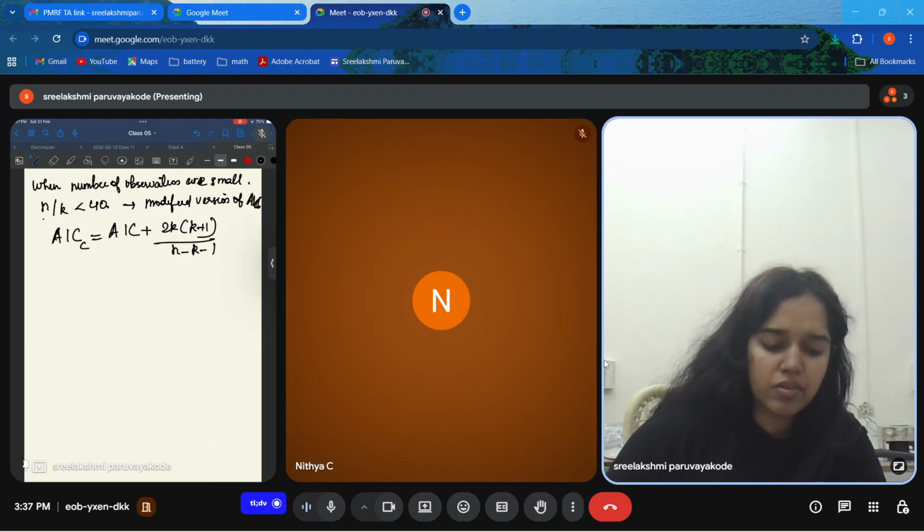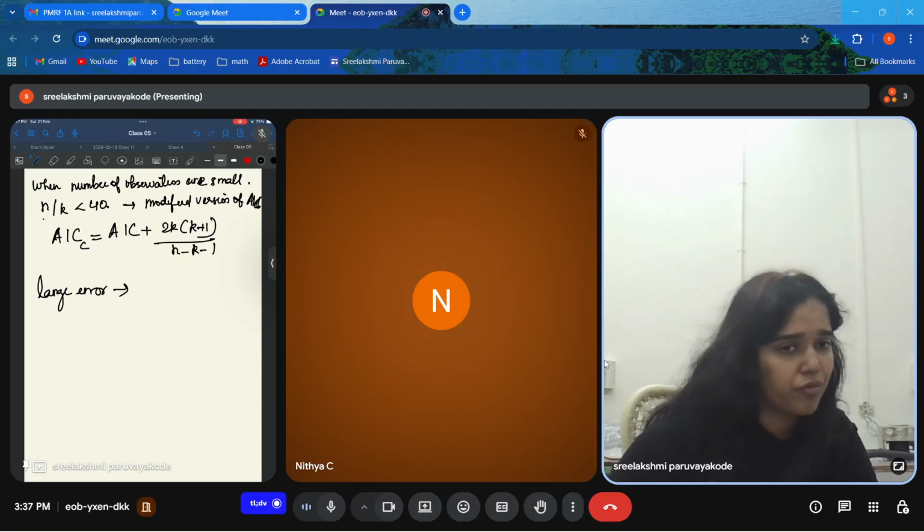Now, when the error is very large, that means we cannot be confident about the predicted value. This value you have fitted, but if the error is high, how can I be confident about that value?